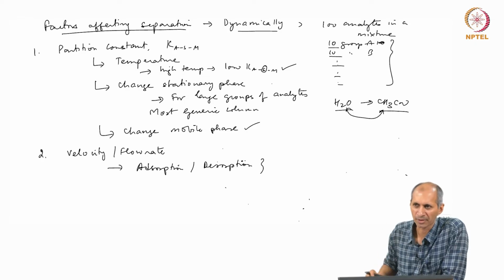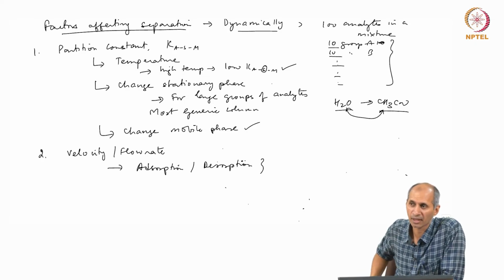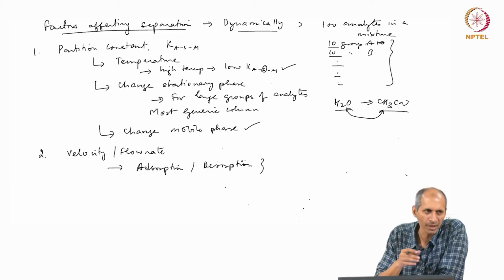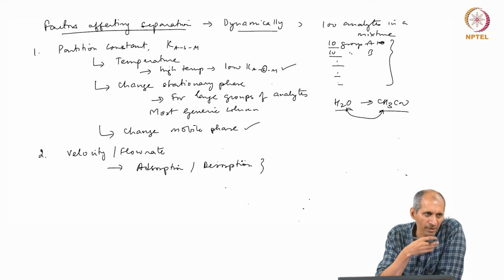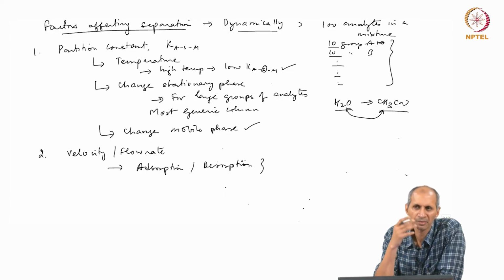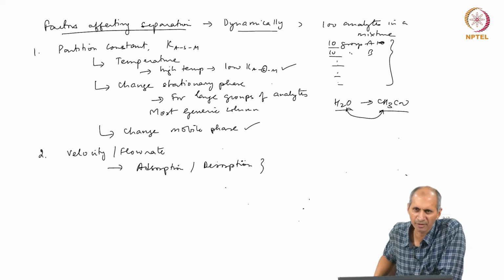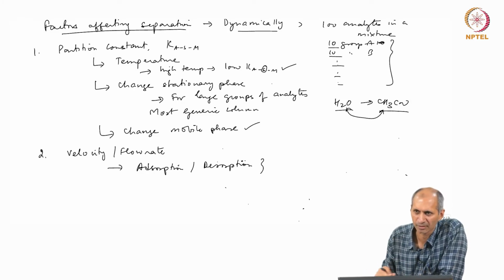Chromatography is fairly old, but current systems are called ultra rapid chromatography separation, which means they don't want to spend even this much time. They want to do in 2 minutes what used to take 25 minutes, which will increase sample throughput. So, the sample analysis becomes more efficient. That is the engineering part of it, which relies on some of these basic factors.